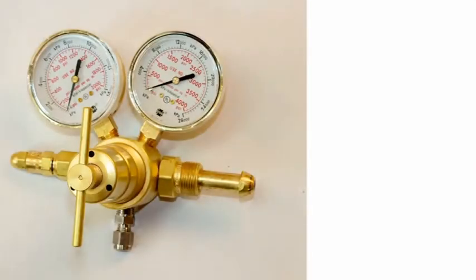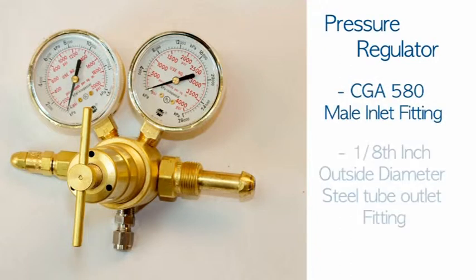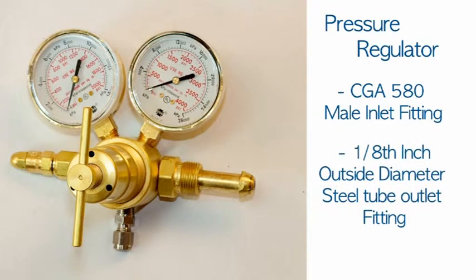If you've purchased a pressure regulator from NEXT ADVANCE, it comes equipped with a CGA 580 male fitting on the inlet and an eighth-inch outside diameter steel tubing fitting on the outlet.